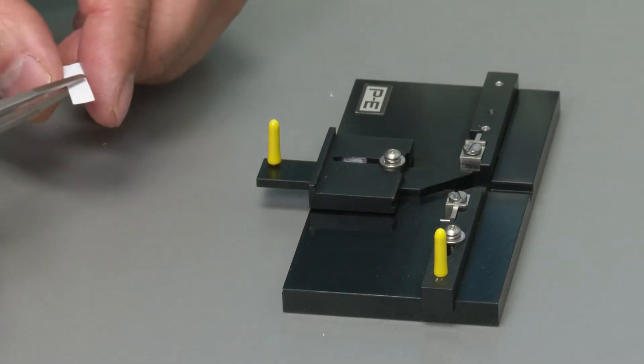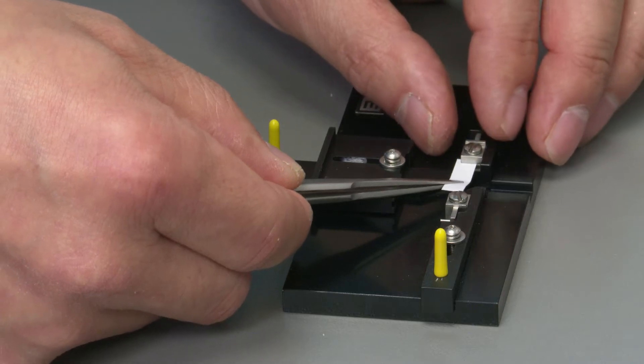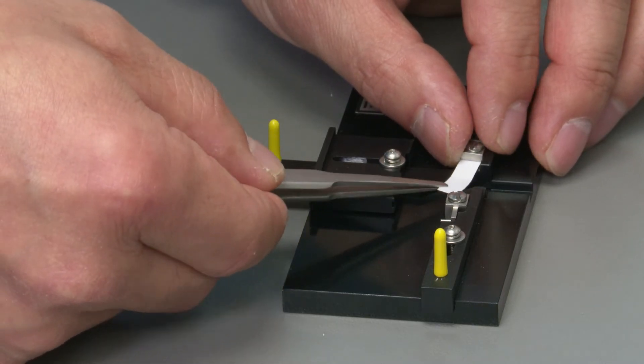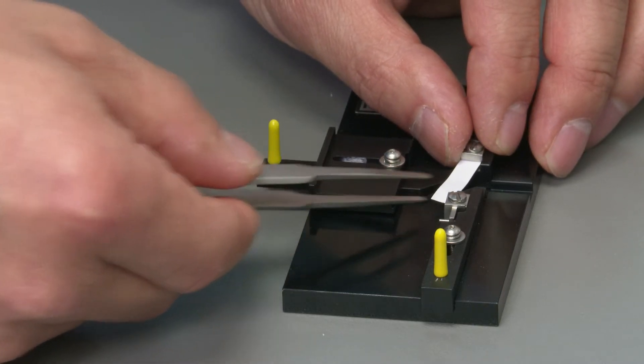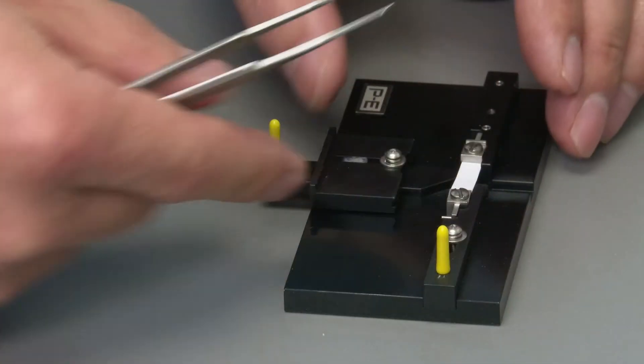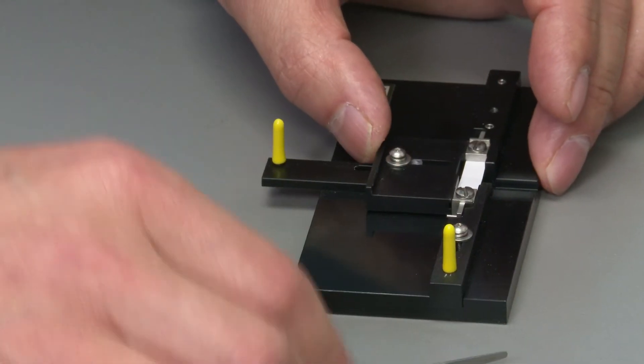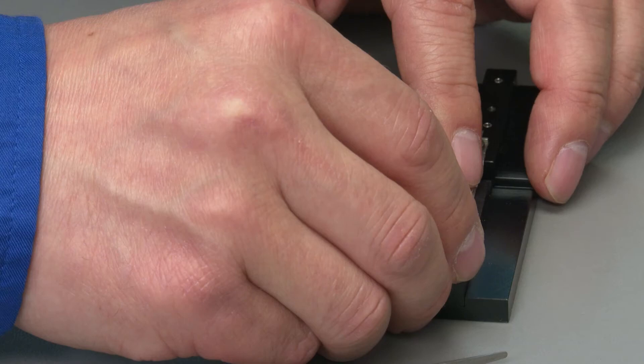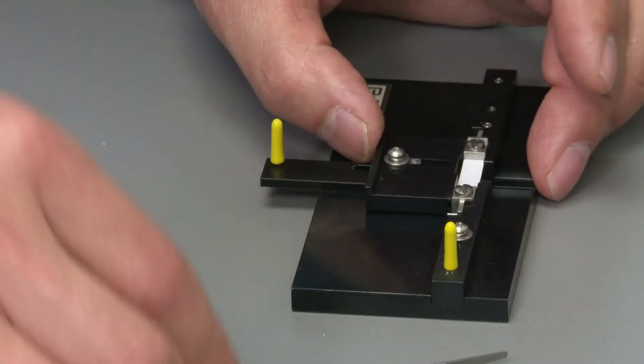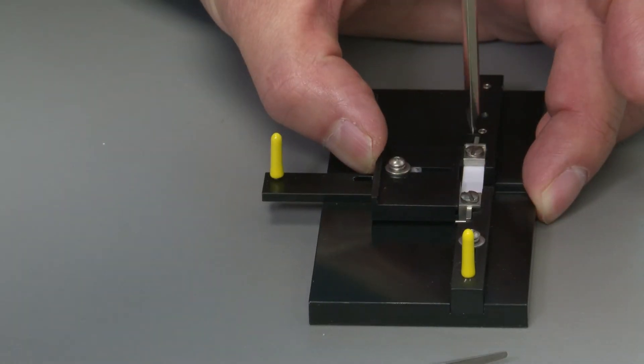Then you can slide your sample between the two clamps and adjust the length and tighten these screws.